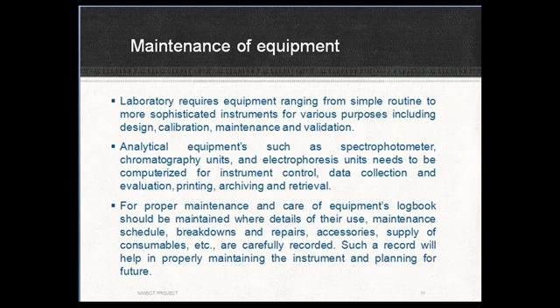For proper maintenance and care of equipments, logbooks should be maintained where details of their use, maintenance schedule, breakdowns, and repairs, accessories, supply of consumables, etc. are carefully recorded. Such a record will help in properly maintaining the instrument and planning for future.